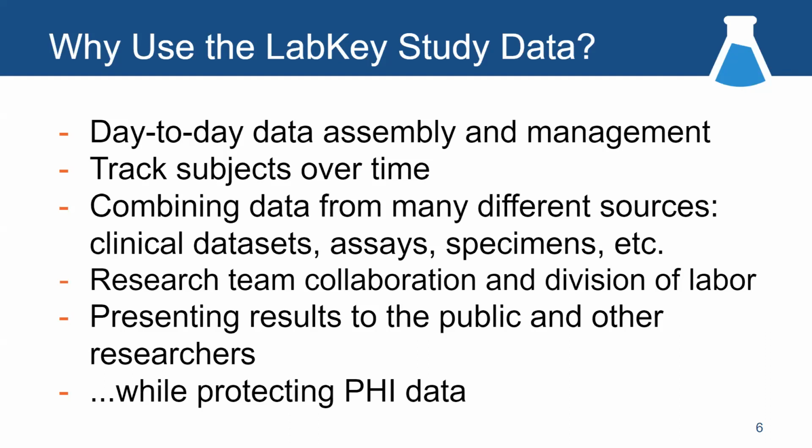Also, LabKey is about presenting your research to the world or to some more elite team, like some other research group, or just the researchers in your own group. LabKey has lots of features around building that relationship between your data and your audience, whoever it might be, whether it's a big audience or a small audience.